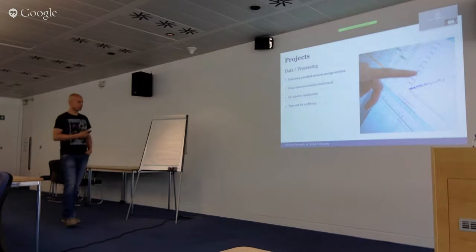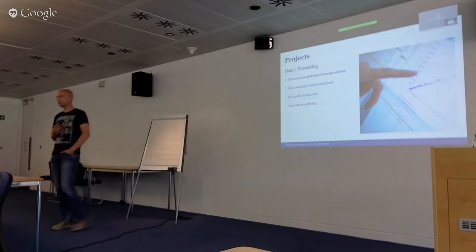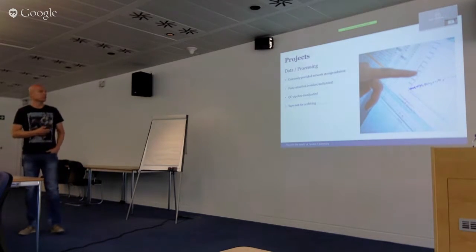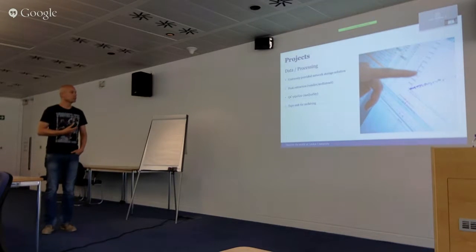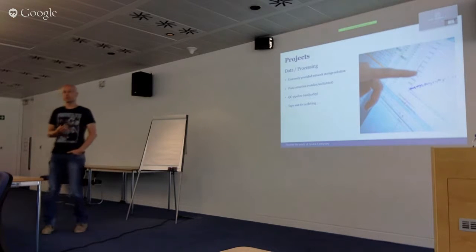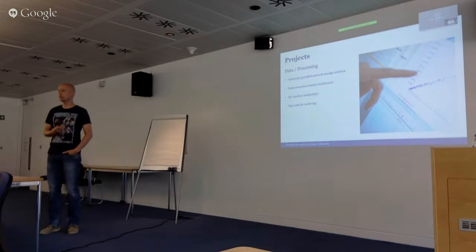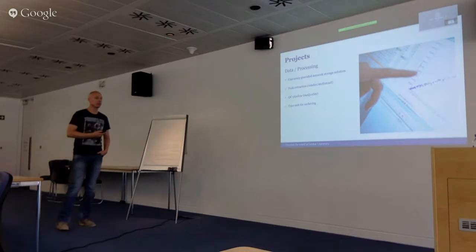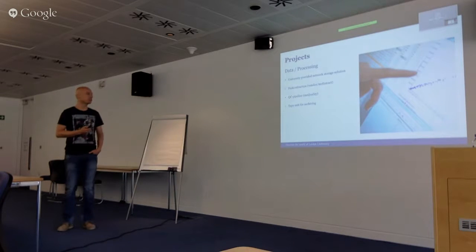I think the data processing is quite similar to the others, except that the data treatment is usually done, especially in the production lab, with the vendor software. It's usually suited best for the format of the files that come out of the machine, and conversion is always time-consuming. Data size grows. People don't know what to do with it anymore, don't trust it, or see that the open source products often change, and like I say, sometimes don't trust it anymore.